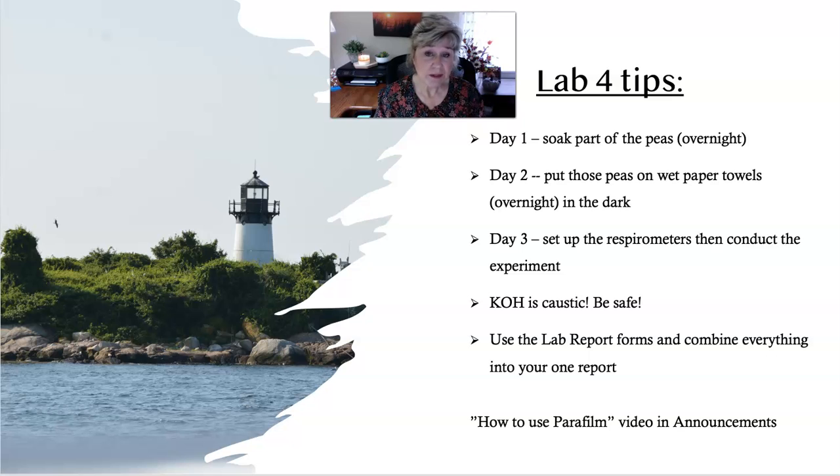Just follow the directions. It's not that difficult to do, but it does take several days. You have to start by Thursday in order to get your lab report finished by Sunday. My suggestion is to start this even earlier in the week to make sure everything works. A couple of hints here. Potassium hydroxide is caustic. Use your safety equipment. Wear your glasses, wear your gloves, make sure nobody's in the room with you.